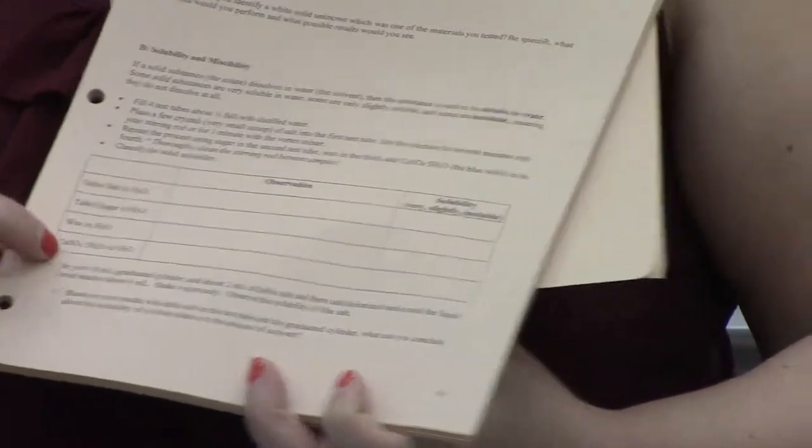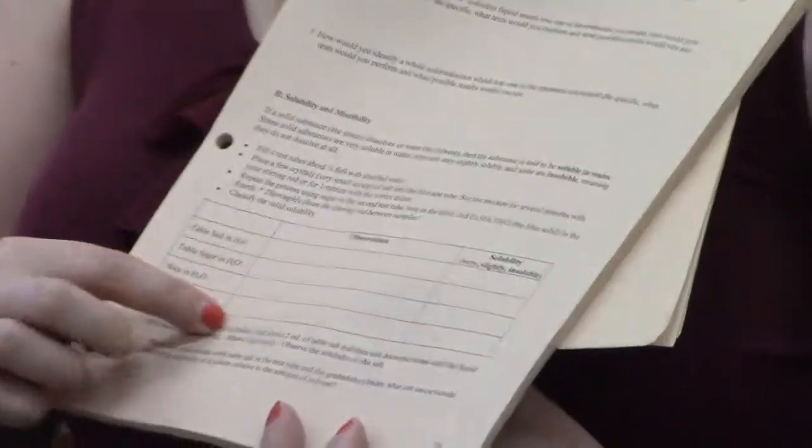So what we're going to do, if you look at that little table, is we've got 4 solids: table salt in plain water, table sugar in plain water, wax in plain water, and then the copper sulfate in the plain water. Okay?